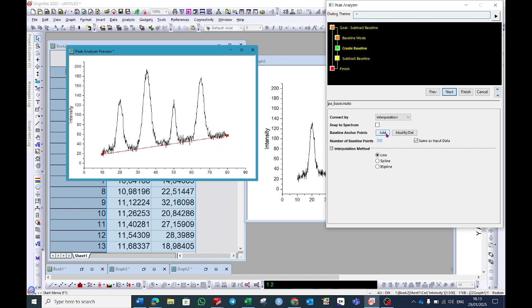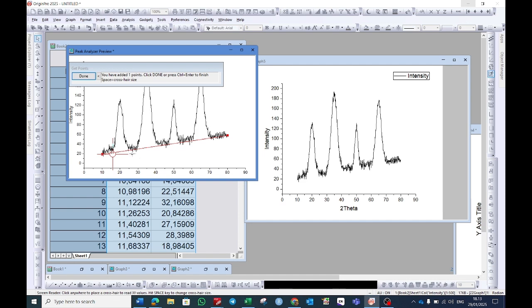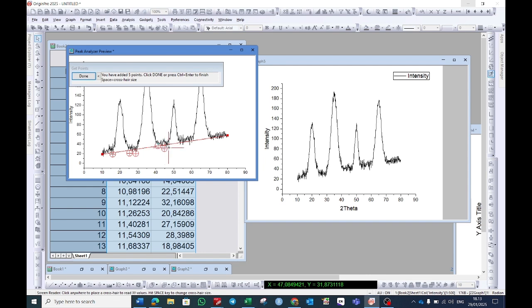So we will add a few points. Select this add button, and then by pressing double click on the mouse, you can generate as many points as you want. Make sure that the points are close to but below this line, and select different points within the graph.